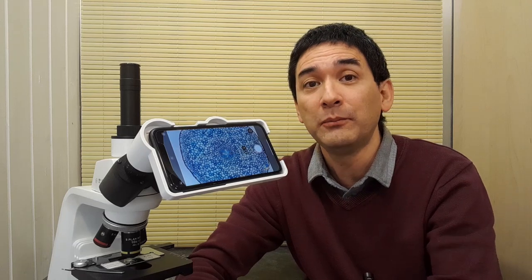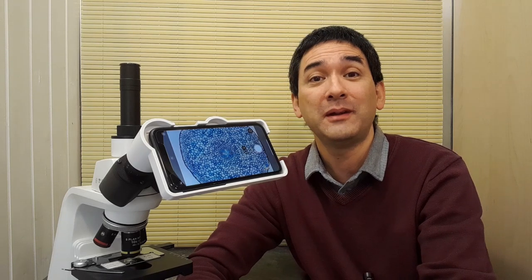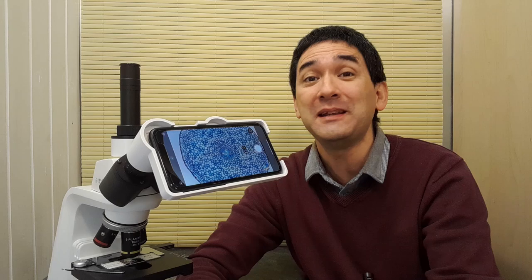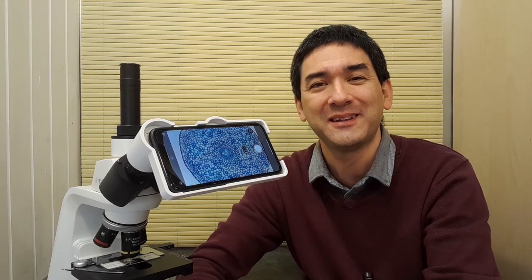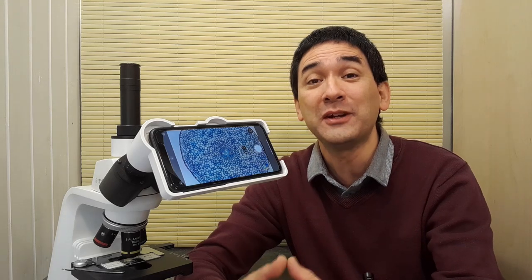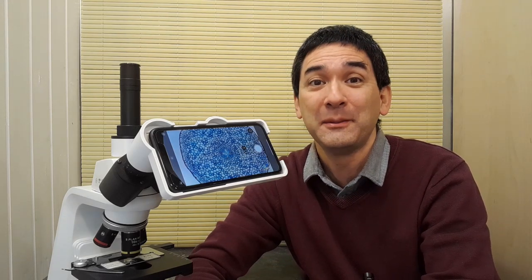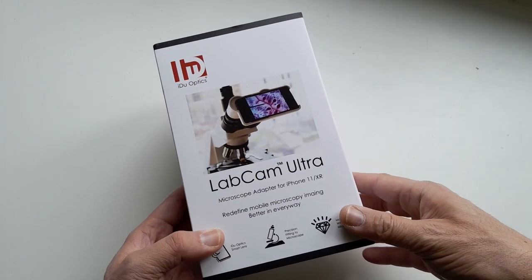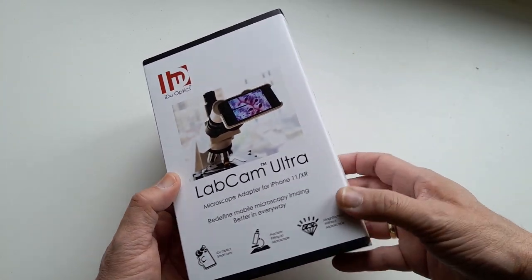At the end of the video I'm going to also tell you I think the biggest advantage and also the biggest disadvantage of this adapter so you might want to watch until the very end of this video but I'm going to now start unpacking the box.